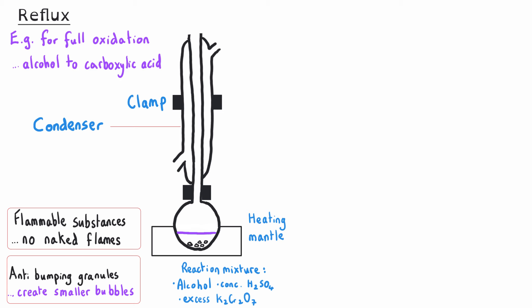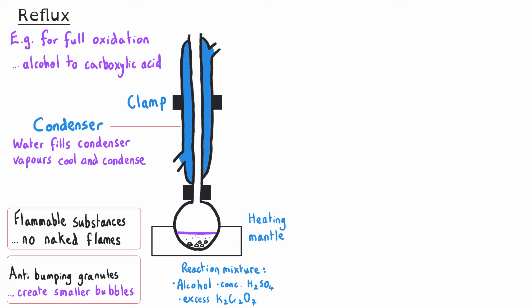In addition, it's important that we have some anti-bumping granules in our reaction mixture. These ensure that the bubbles created are smaller, and this stops the reaction from being too violent. The condenser itself is a vertical glass tube with a cooling jacket around it. This cooling jacket is filled with water, which comes in at the bottom of the condenser and goes out at the top. This ensures the water totally fills the condenser so that the vapors cool and condense in the right positions.